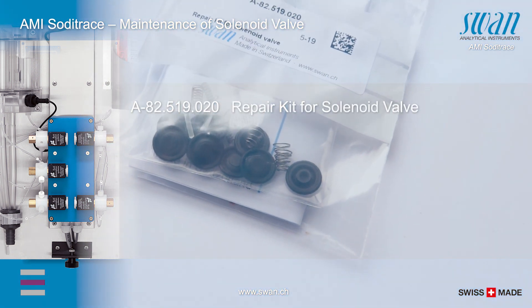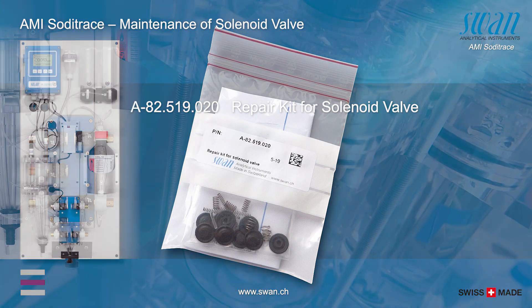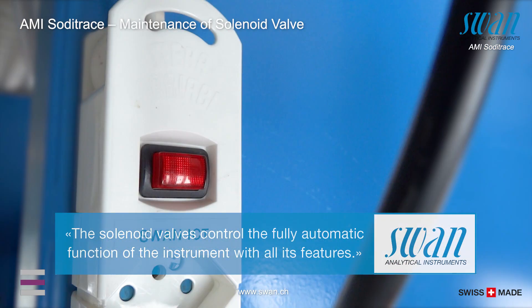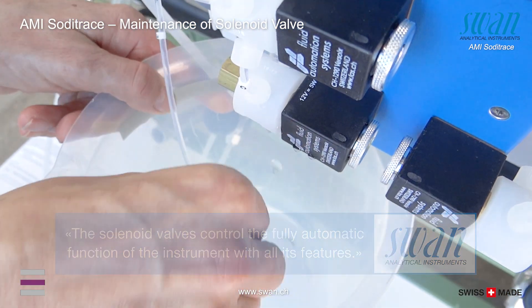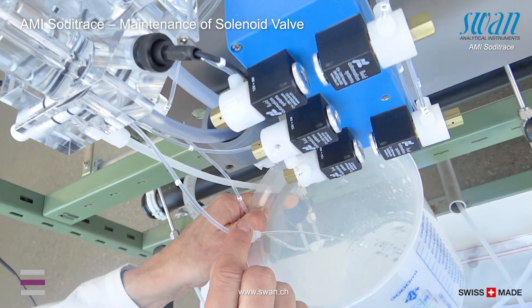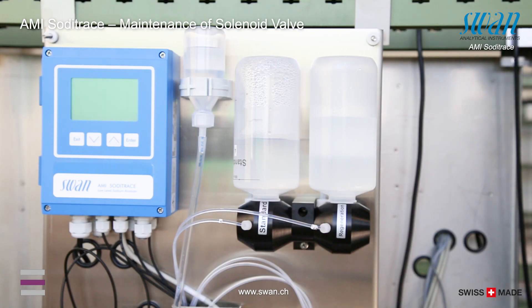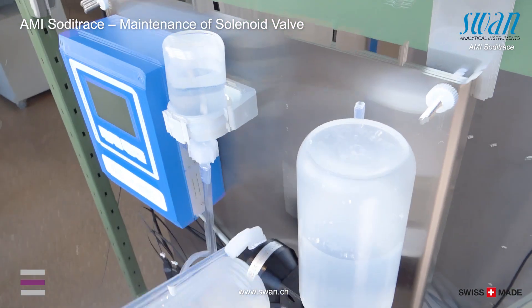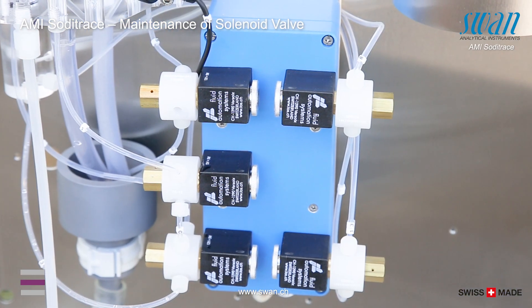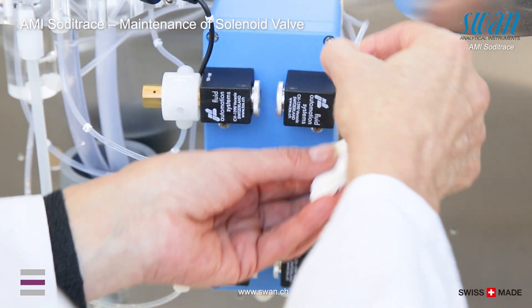The following spare part is available for the maintenance of the solenoid valve. The measuring chamber needs to be emptied completely before starting the maintenance on the valve. Tilt down the two bottles for the standard anti-regeneration solution. Remove the tubes from the defective valve.